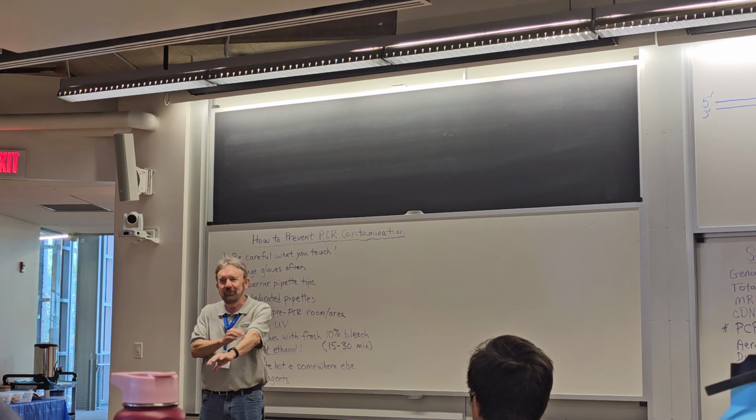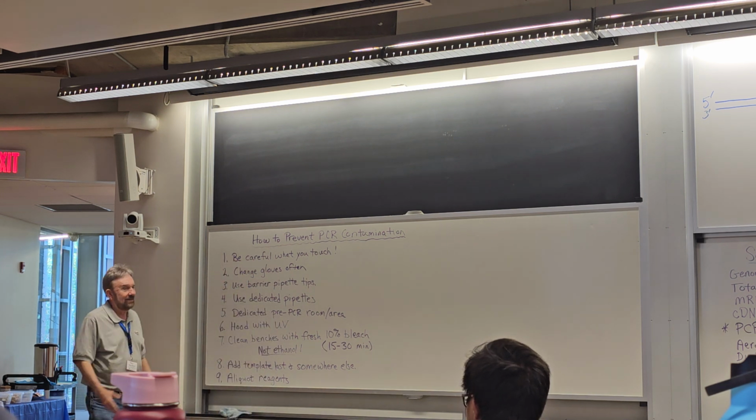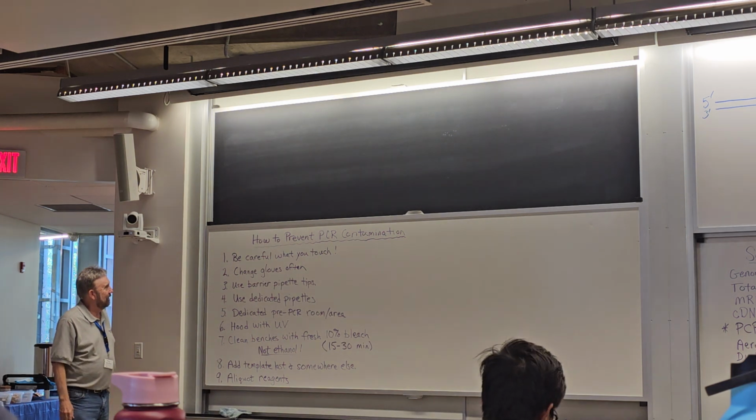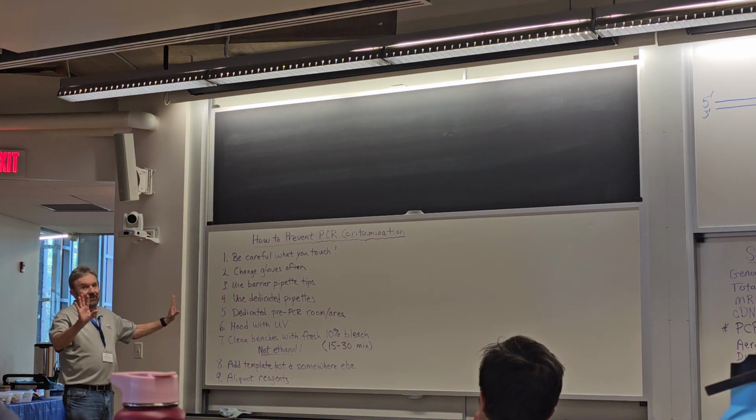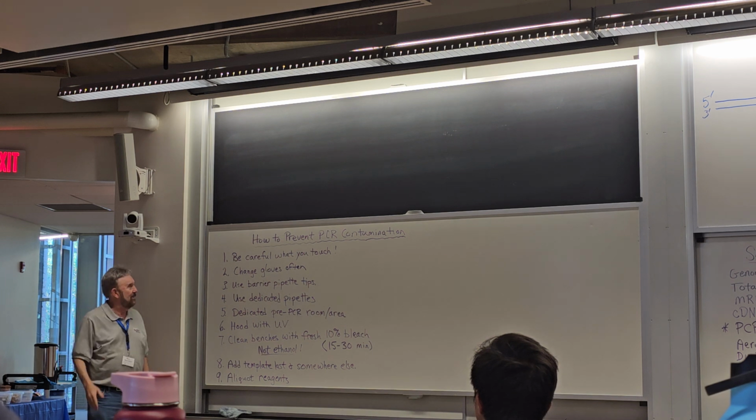Don't touch anything. Don't scratch your arm, right? Your arm is covered with nucleases and who knows what else, and DNA, perhaps from the lab that you were working in. So try not to touch anything except for what you have to touch, right? So a lot of this is sort of common sense here.